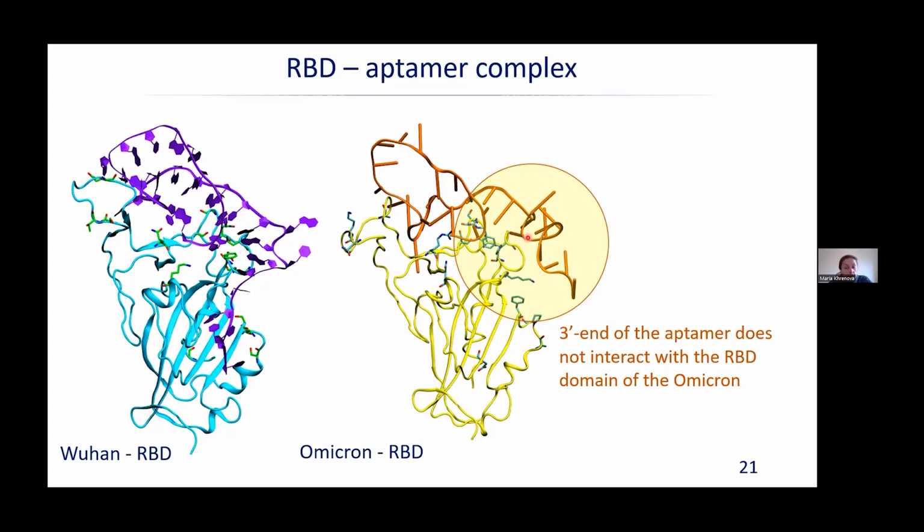Let me remind you that according to our nanopore sequencing data, the right end of the aptamer was much more important, as the enrichment of each base type at each coordinate is more pronounced at this right end.